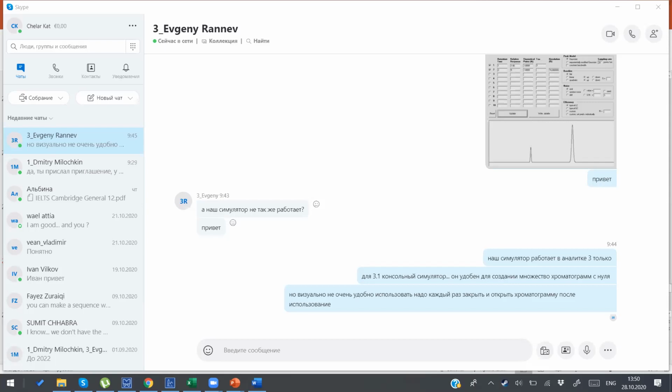Yes, of course, but typically it is not required for a natural gas analyzer. We need it for the pharmaceutical industry. But yes, of course, our software has compliance with Part 11 of CFR 21 according to FDA requirements. If you need, I can send you special documents to confirm that.